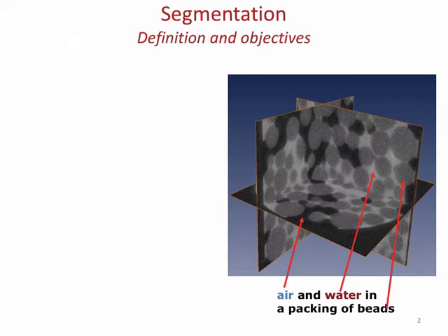So essentially here, for instance, this layer could be interpreted as some sort of non-wetting film, which is not physical here. So you have to be careful that your grayscale value is not misidentified, because all that we work with when we're doing segmentation is grayscale values and maybe their derivatives. Okay? So look at your image.